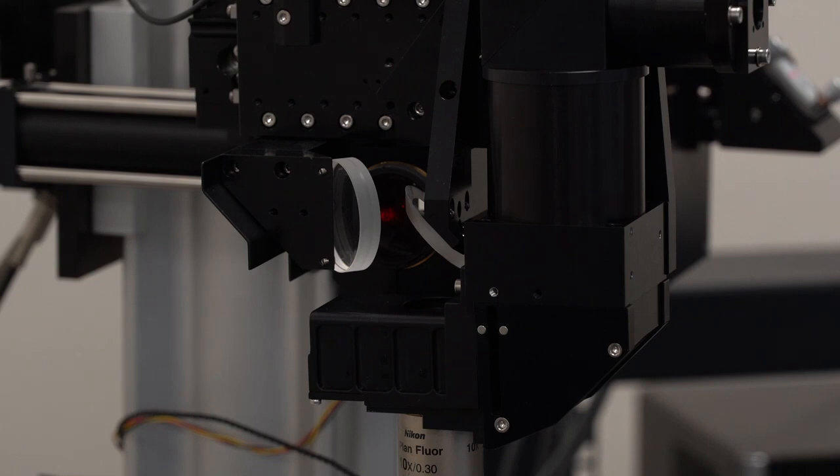Dan Dombeck first developed a light cover like this for the short path detector on the MOM in his lab. Now we have extended the same concept for the wide path detector. A light type cover with a hole in the top sits above the objective. The hole has a filter that allows infrared excitation light through that blocks visible wavelengths. In this version for the wide path, the cover moves out of the way for wide field imaging.